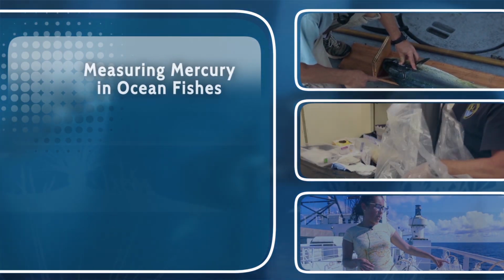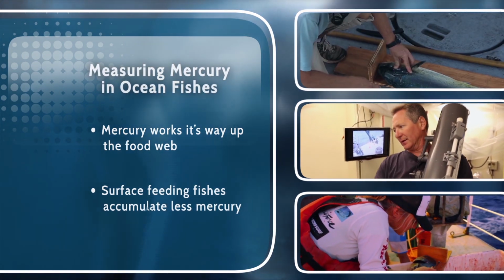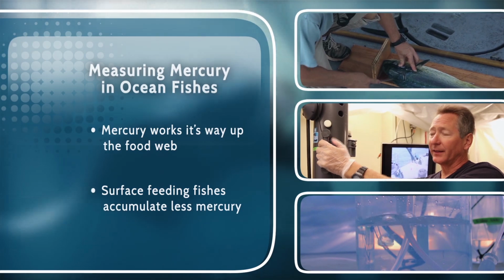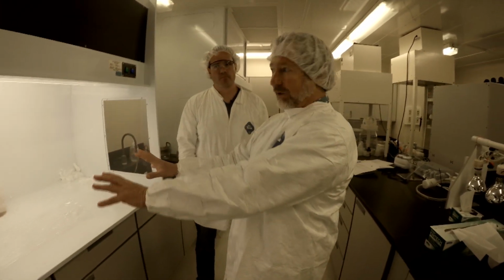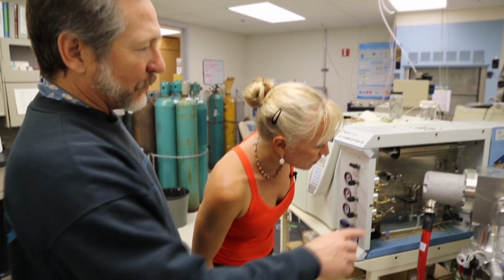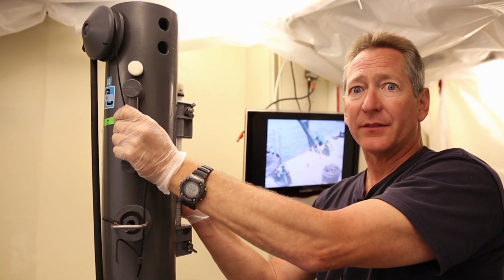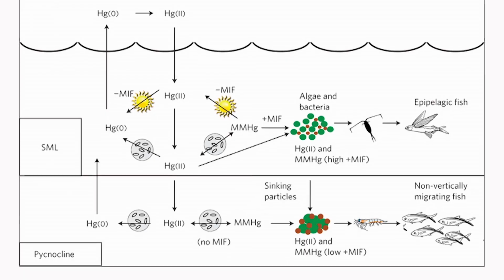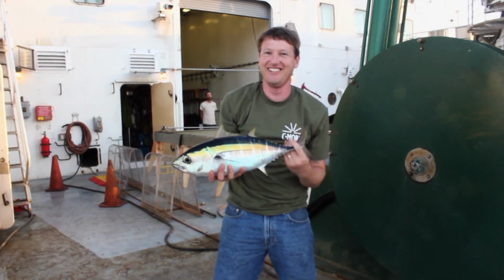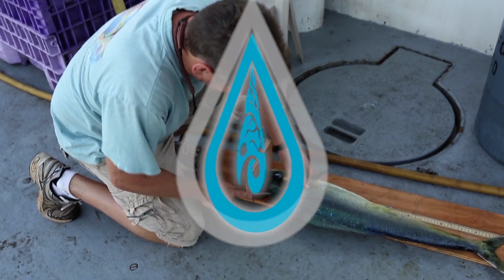In this special episode, we're taking a look at mercury in the ocean food web. We'll go from the research vessel Kilo Moana, where fishes are caught and initial mercury tests are performed, to the labs of UH Mānoa, where scientists study trace mercury from the samples collected at sea. We start off with Dr. Brian Popp from the University of Hawaiʻi School of Ocean and Earth Science and Technology. Brian explains what mercury is and the tools he uses to identify both the concentration and the source of mercury in our food fishes.